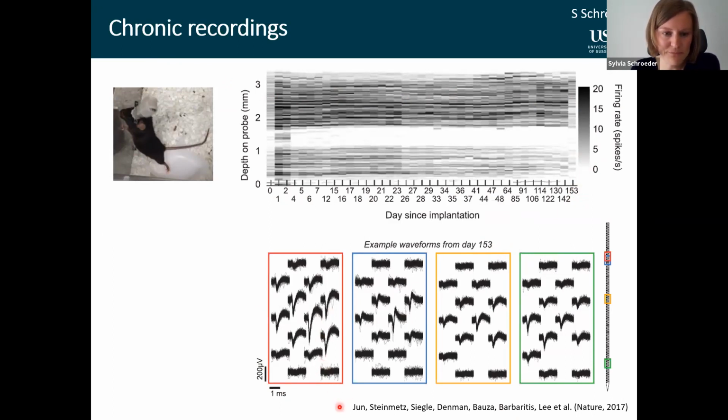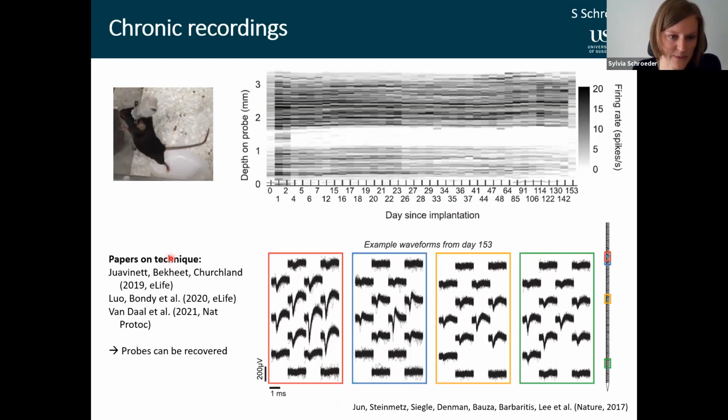And there are several papers who have used this technique and also describe how they did it, so what kind of hardware they used, and also they developed hardware so that the probes can be recovered after the experiment and can be used in a different animal if you're careful.